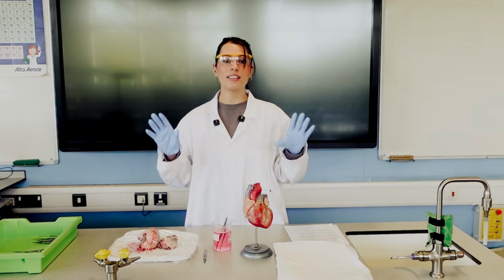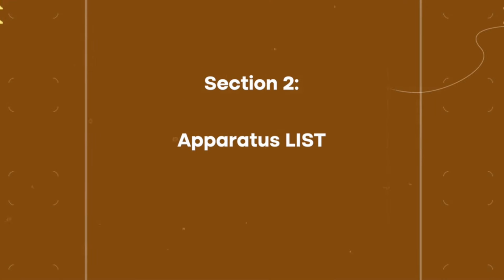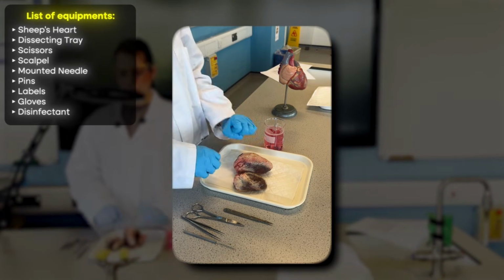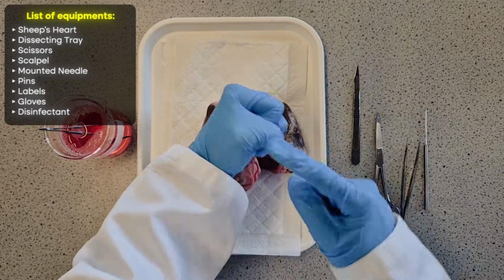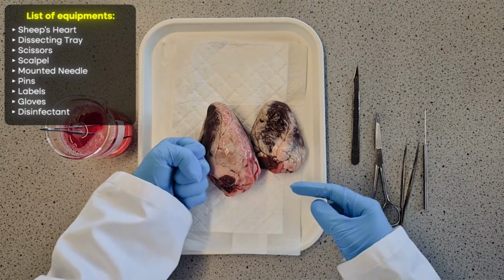So as we go through, those are some of the key things that I'll be pointing out for you. The key equipment that you're going to need for this practical is a heart. Now we typically use a sheep heart. It is similar in size to the human heart, and you can tell this by if you put your hand as a fist. The size of a fist is approximately the size of your heart. That's something I'd always show the students as well.